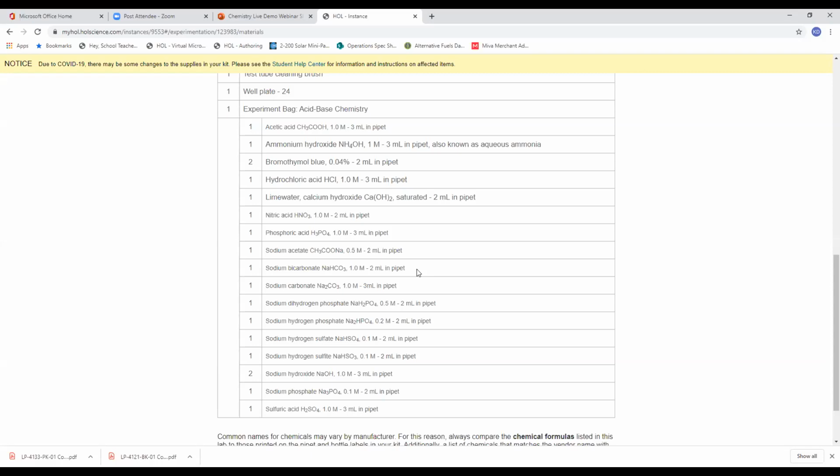not concerning for the student, or should not be concerning for any jurisdiction when we're talking about 20 drops of the chemical at most being left over. Obviously, the spent chemicals in the reactions have been neutralized by the reaction, so they pose no harm either. And then from a safety standpoint, you'll see momentarily how these chemicals are disseminated from the containers. You'll realize there's no danger to students in terms of spills or anything like that.